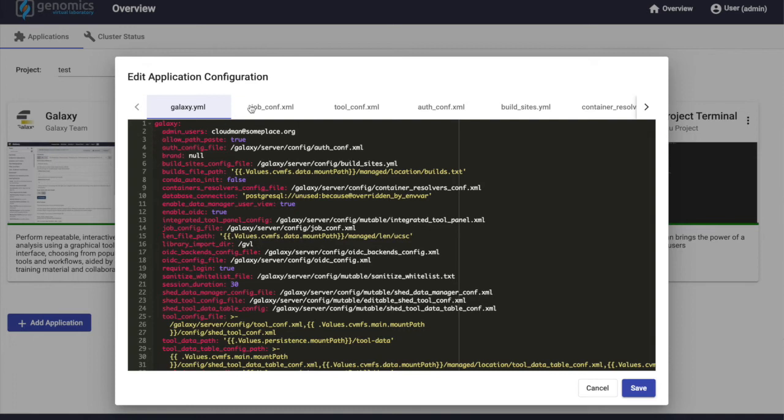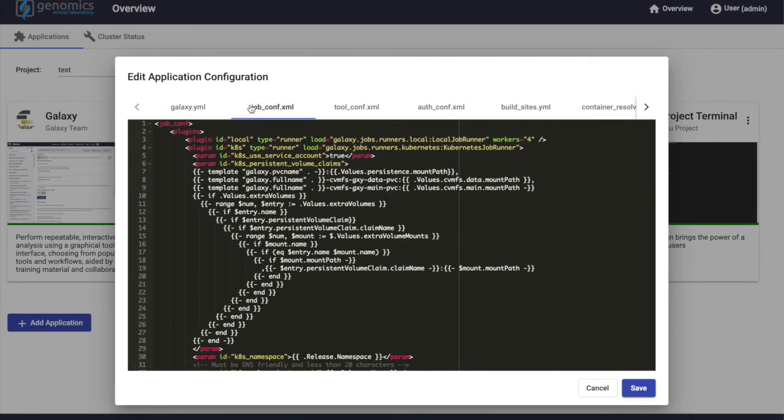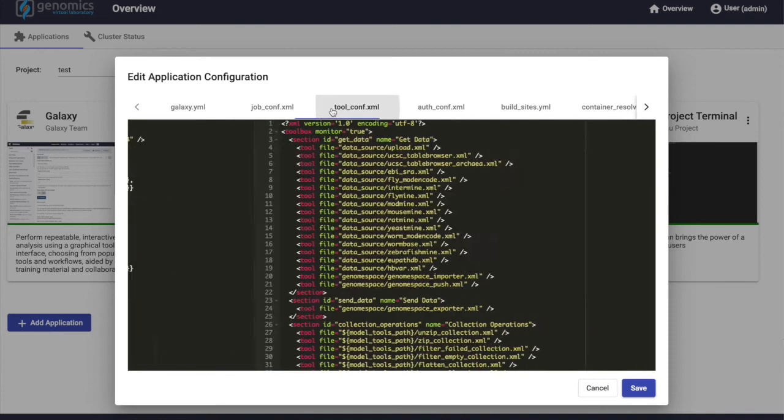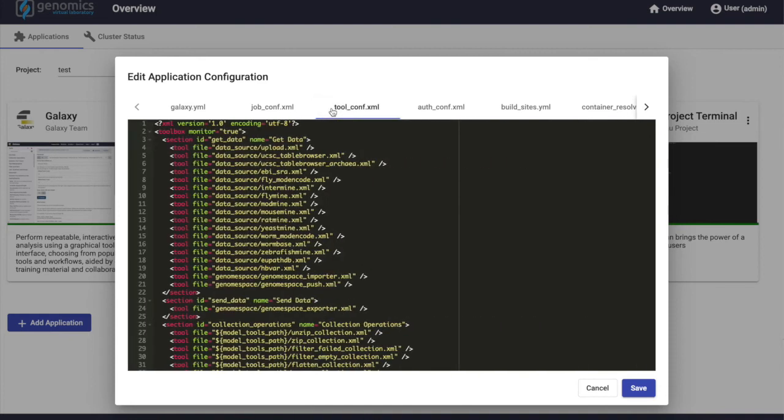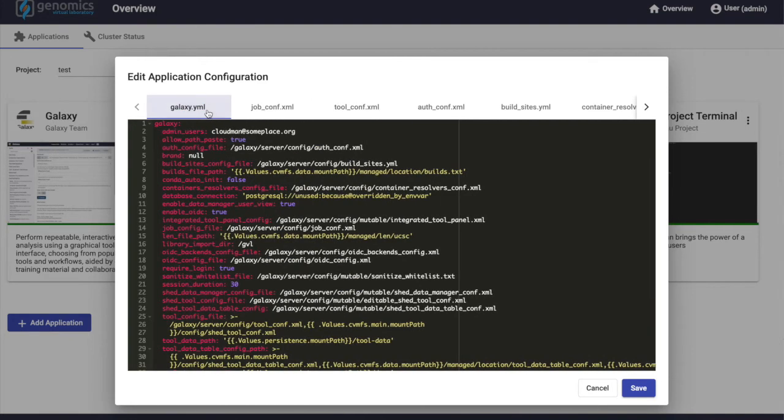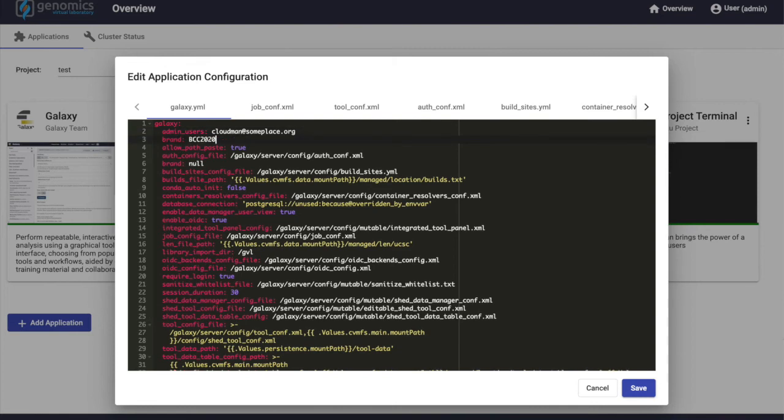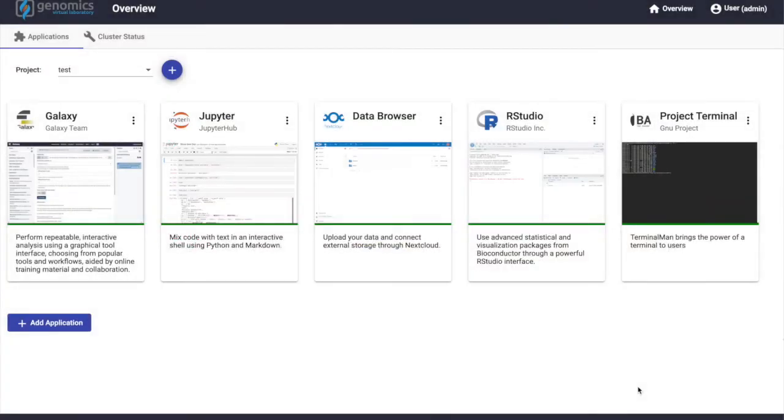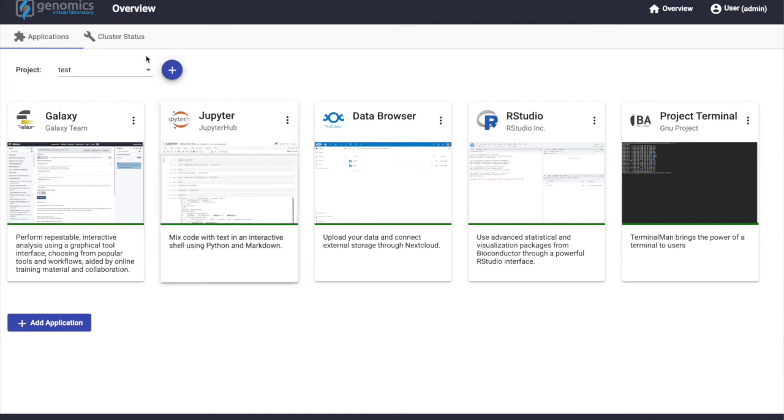In the case of Galaxy, we have access to the common Galaxy configuration files that we can see here, all in a visual editor. So for example, if we want to change a value of galaxy.yaml by setting the Galaxy brand, we enter the value, hit save, and GVL would automatically provide a zero downtime rolling upgrade of Galaxy to roll out the new version with the updated configuration settings.